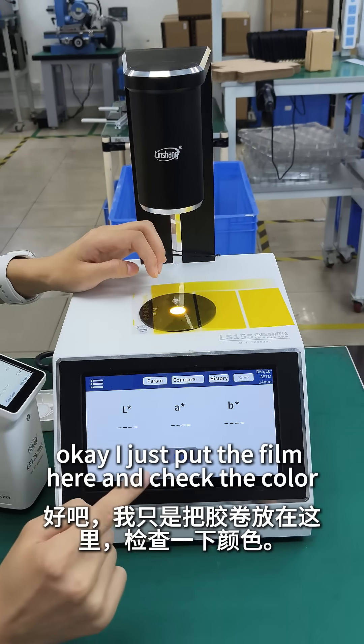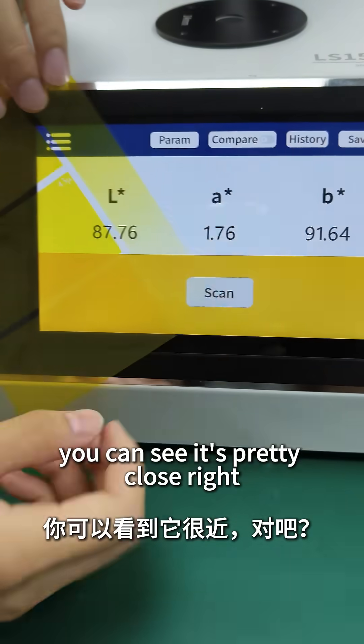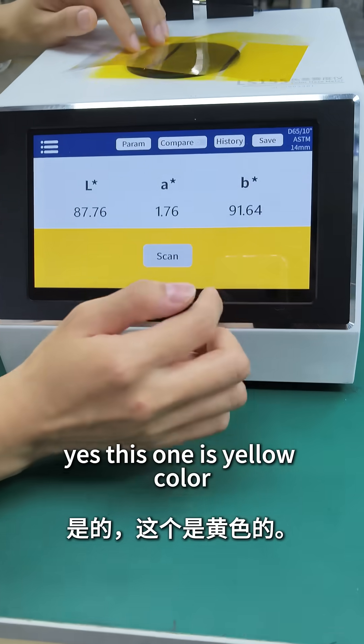Okay, check here, and check the color. You can see it's pretty close, right? Yes, this one is yellow color.